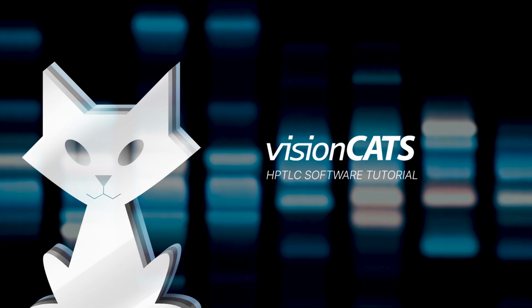Welcome! In this tutorial, we will introduce the method collection and show you how to access, download, and import HPTLC methods into your visionCATS system.